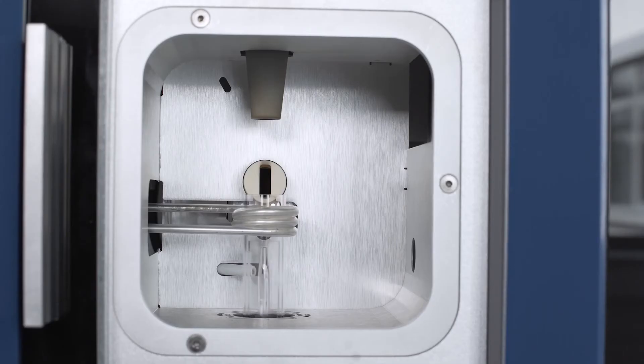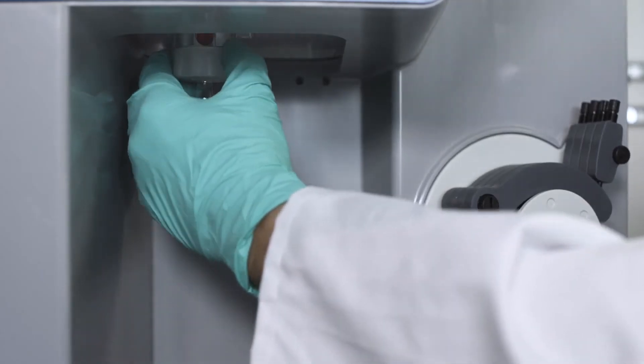Achieving a new level of robustness, enabling supremely confident analysis of any sample from clean drinking waters to used engine oil.